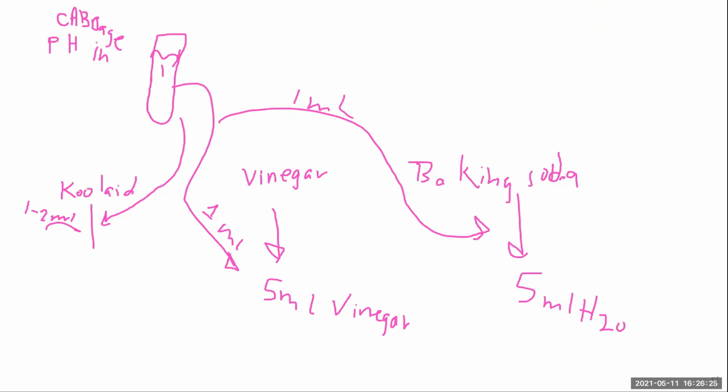But I had Nate and them test earlier because technically it should be neutral, right? It should be a pH of 7 because you're having an acid and a base. Baking soda is a weak base, and acetic acid is a weak acid. So you're adding a weak base and a weak acid. It comes together, you should have basically water and a salt. So you should get a pH of about 7.